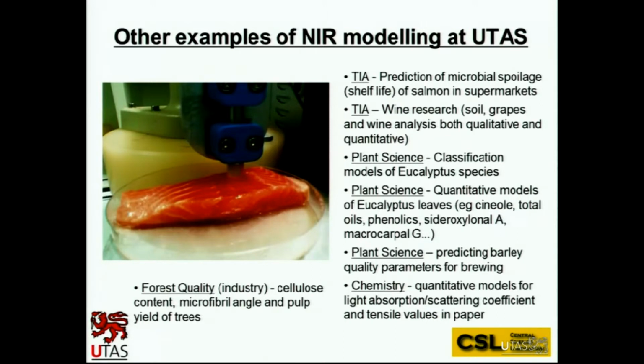So in theory, you could take it home now and have a nice piece of salmon because literally you didn't do anything to it. We've used it in the wine research. Bob Bambergs obviously is a guru in that area and uses mid-infrared and near-infrared quite a lot.